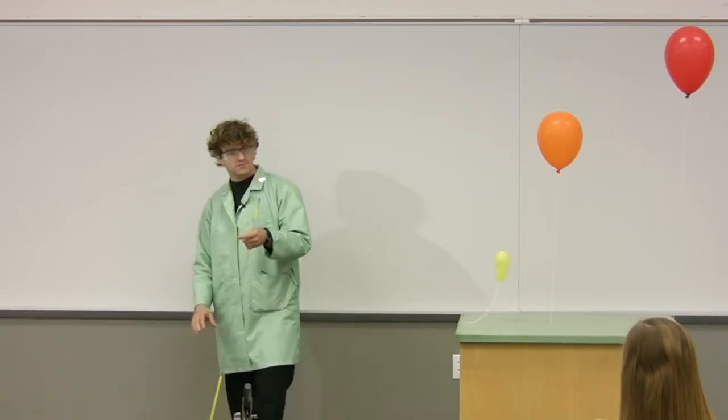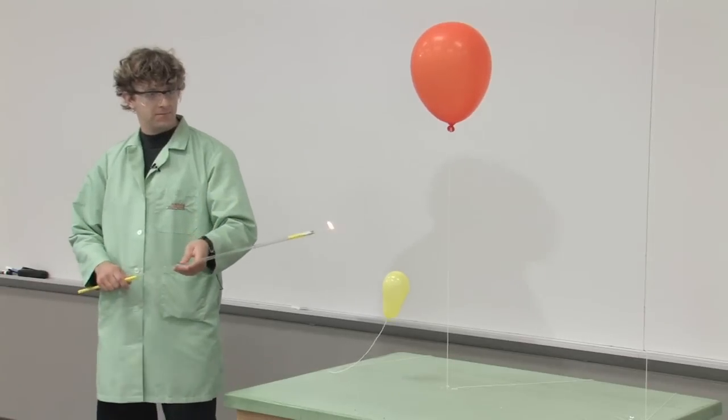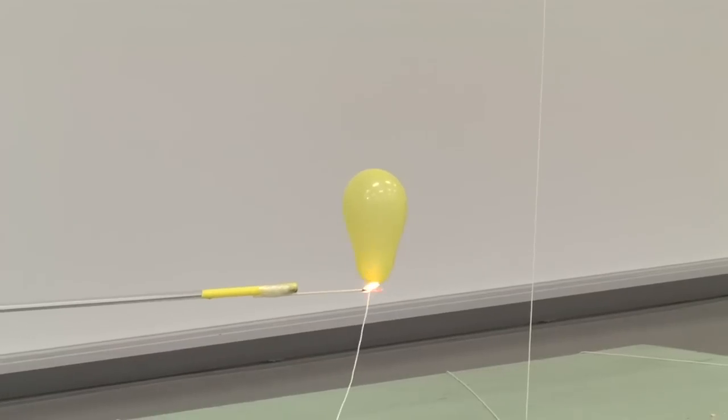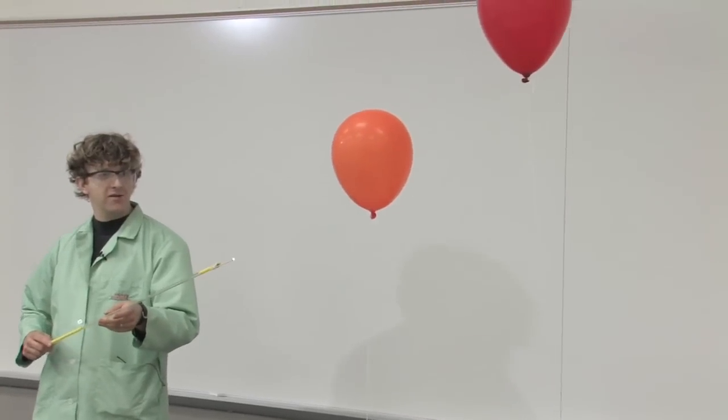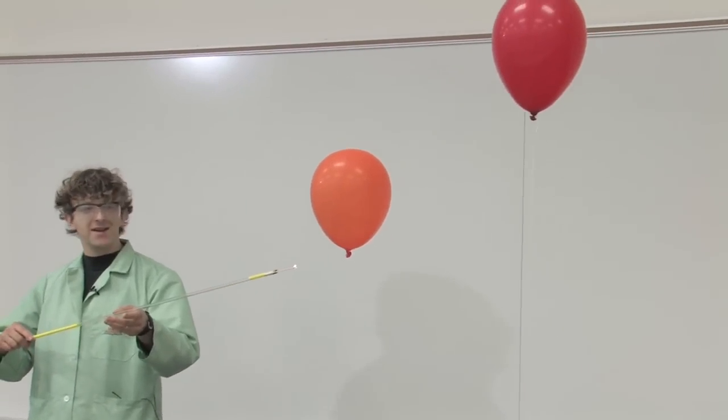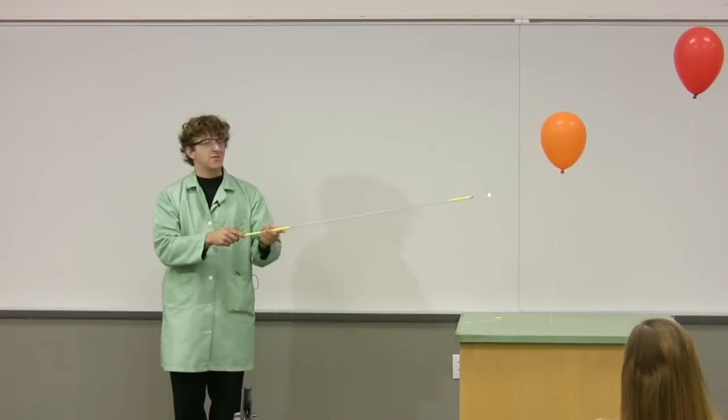We'll start with the small one. Okay, still have some flame there, so I'm going to go with the bigger one. It makes a nice sound too. I'm going to stand a little further away for this one too.